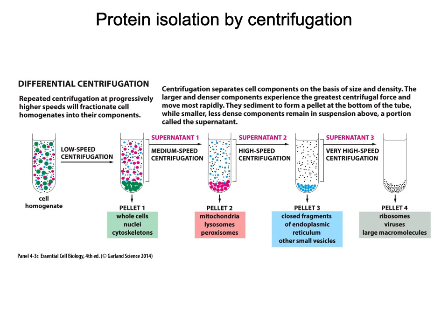I just briefly want to talk about the technique of centrifugation. So you can see that we have these different speeds. Low speed centrifugation would be something that you could do on a tabletop centrifuge, so maybe one of those little bench ones that you might have in a lab. You can put like 20 microcentrifuge tubes in, and you would spin that for like 5 minutes, right? And you would get your pellet formed.